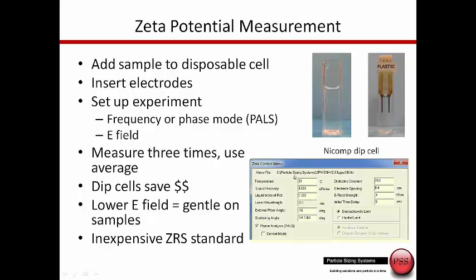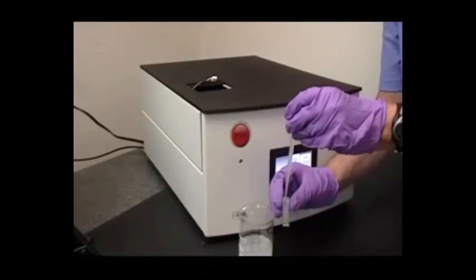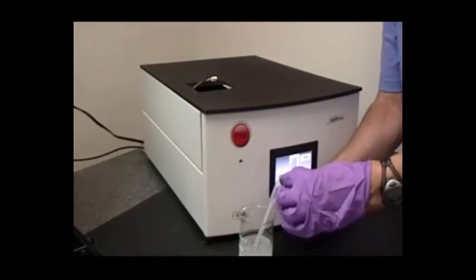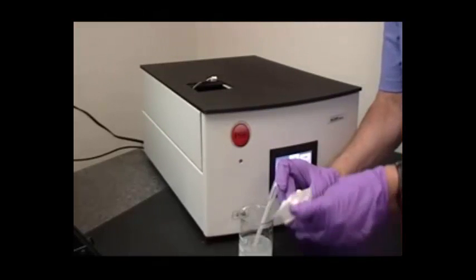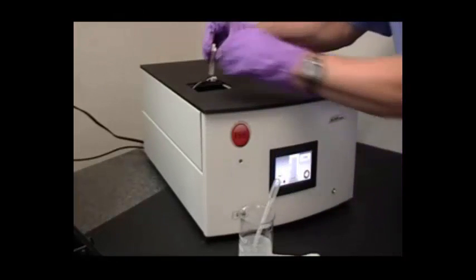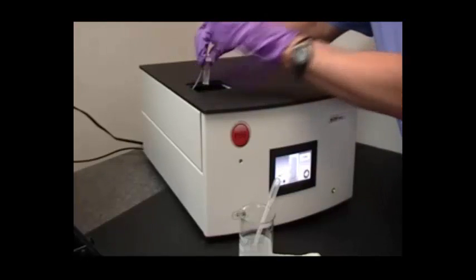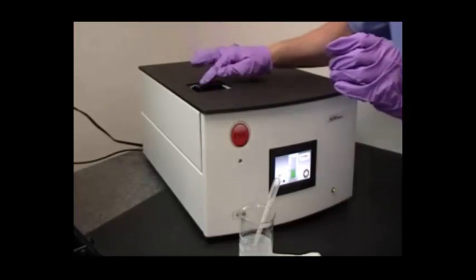This graph shows a setup for the measurement. We fix the temperature, choose the electric field strength, and then choose most of the time the Smoluchowski limit as opposed to Huckel to define the kappa A ratio. To make a zeta potential measurement, add the sample to the cuvette, insert the dip cell, wipe off any liquid from the surface, attach the zeta potential cable, insert into the cell holder, hit go, and start the measurement.